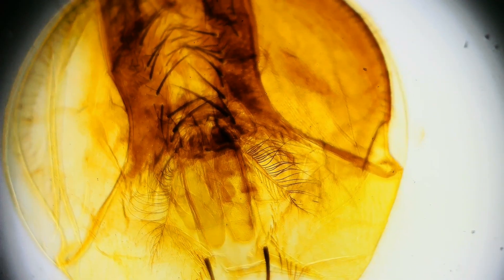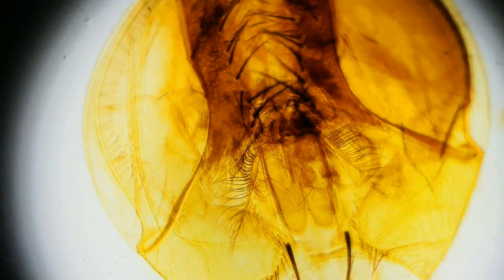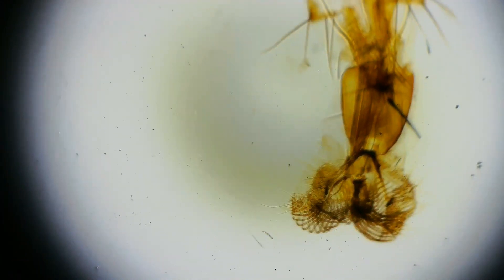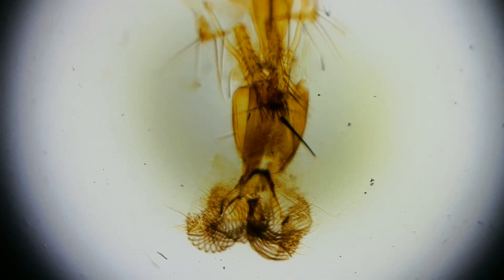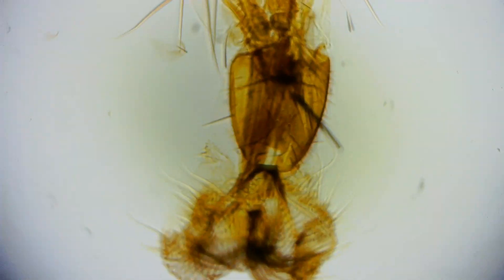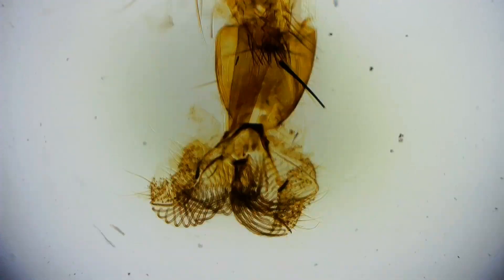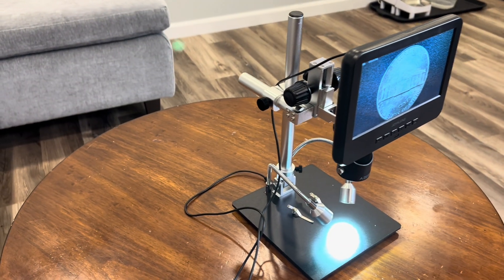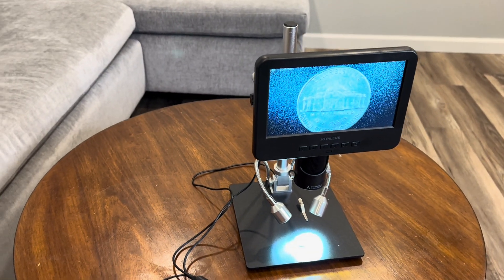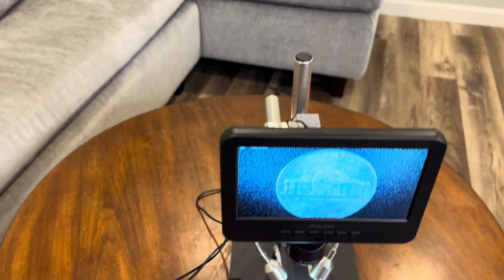Overall, the Joya Lens Digital Microscope offers a lot of great features at an affordable price point. With its impressive magnification range, large display, and ability to capture photos and videos, it's a versatile tool for students, hobbyists, or even some professionals. If you're looking for a reliable and easy-to-use digital microscope with great image quality and flexibility, the Joya Lens JL246MS is definitely worth considering. I would definitely recommend this microscope, especially if you're looking for one that balances affordability with performance — for the price, you're really getting a lot of value.